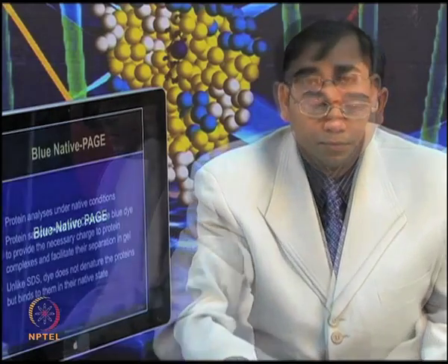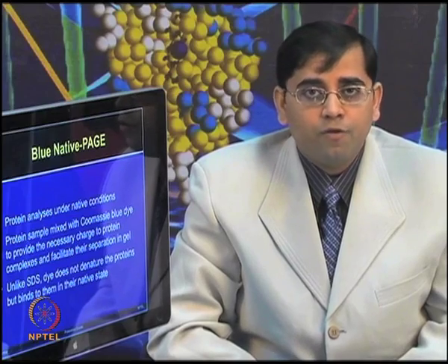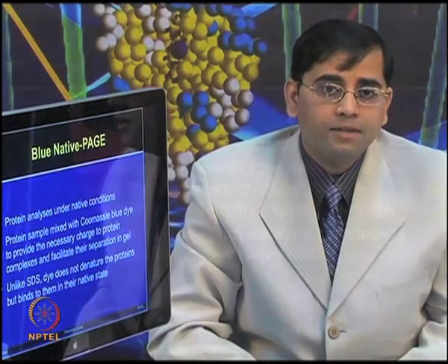So, I will briefly describe the blue native PAGE here. Please keep in mind, this is not going to be used for 2D, but often people also use the native form for the 2D separation. In blue native PAGE, the protein analysis is performed under the native condition.